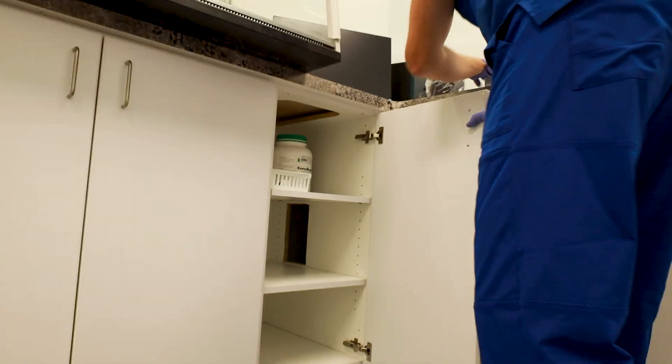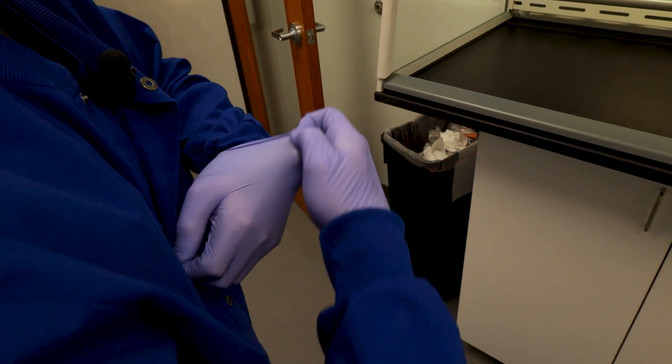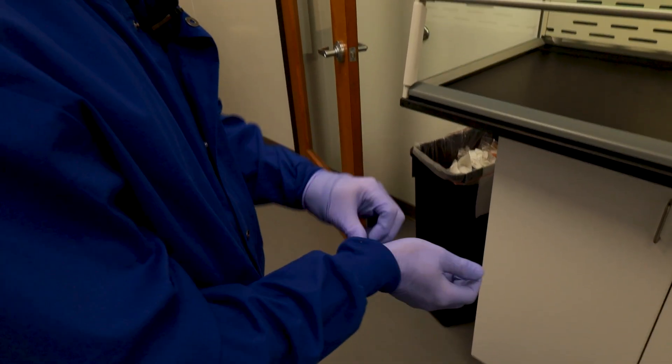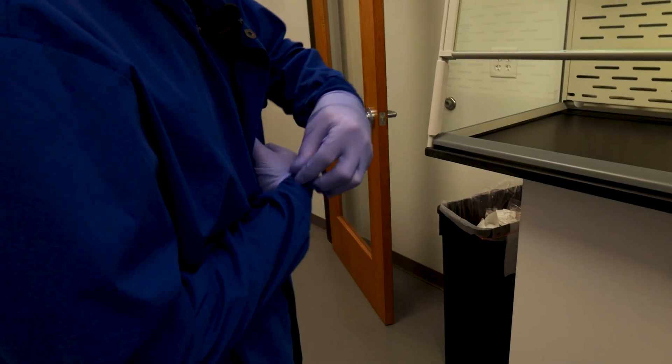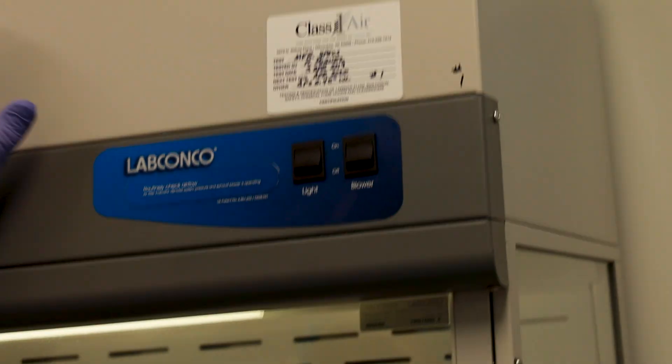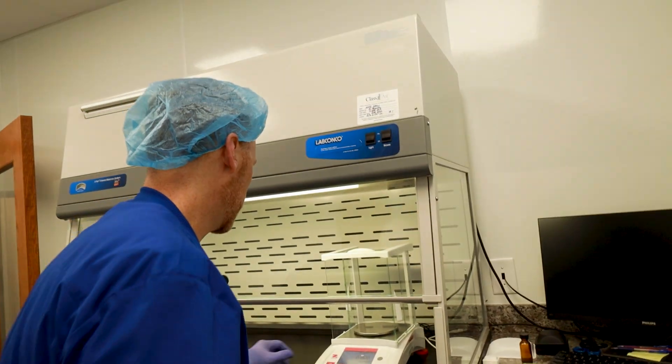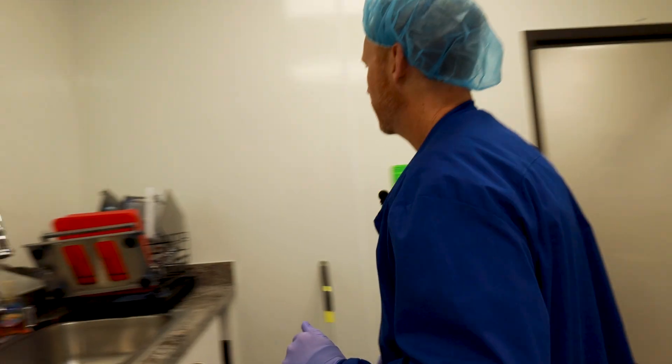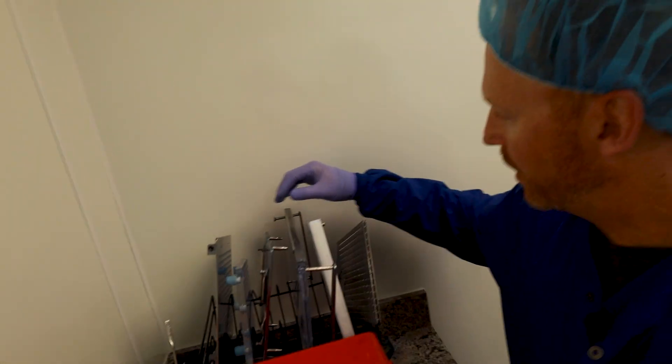Here's my methylene blue. You'd think this looks... Yep. Got her. Alright, we're in. Alright, top of hood. Oh, super important to do that. Get that thing going. Scale never shut off. Why? It takes two hours to warm up a scale like that.